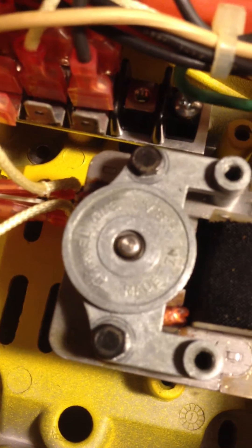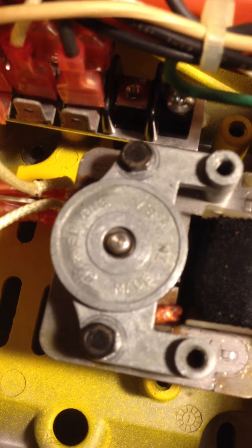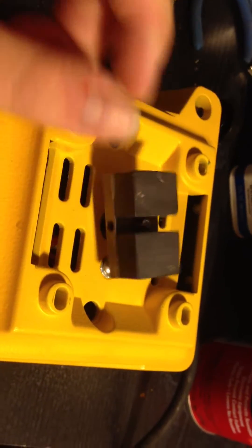So basically what happens is stuff gets stuck in the motor here, right about in here, and it makes it to where it can't turn. This is a magnetic stirrer. Basically the magnet will turn and stir a solution.